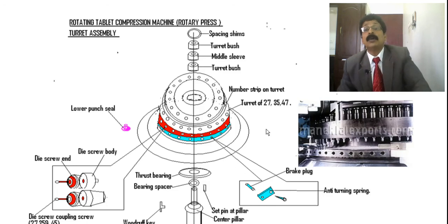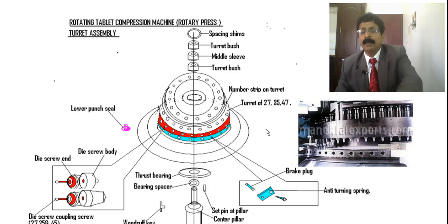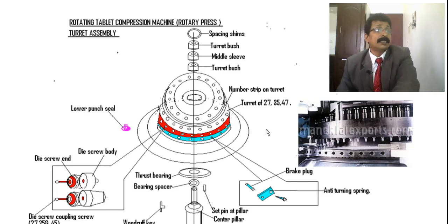Every pharmacist will have only 7 hours of duty, and the next 7 hours another person will be coming. So in that case we have to clean all the instruments and everything. The machinery should be cleaned, using alcohol and everything, and then you leave it, so that the other tablets in the next experiment will not affect what you are doing now.